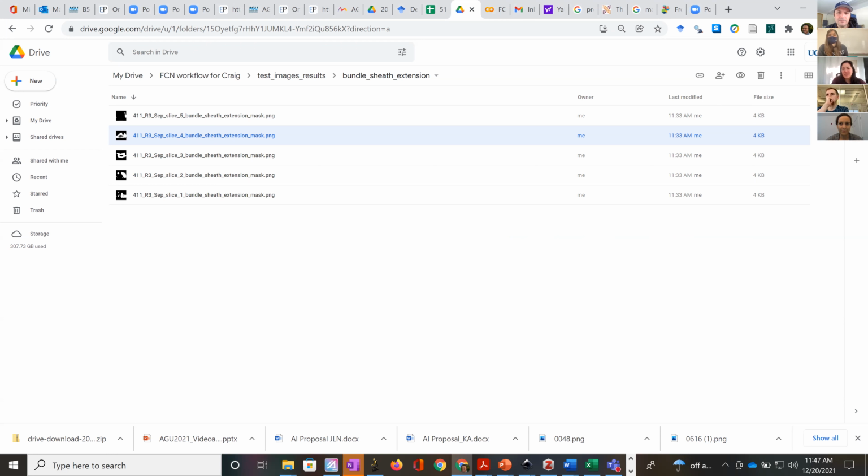Yeah, I would say for one leaf, it's similar to what Guillaume's code is, like 6 annotated images. But here's the thing, you can make a generalized model. And so after you've annotated between 3 and 5 leaves, 6 images from 3 to 5 leaves of a particular, sorry, my biology is terrible.